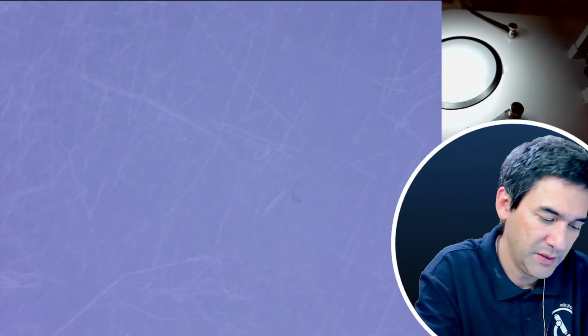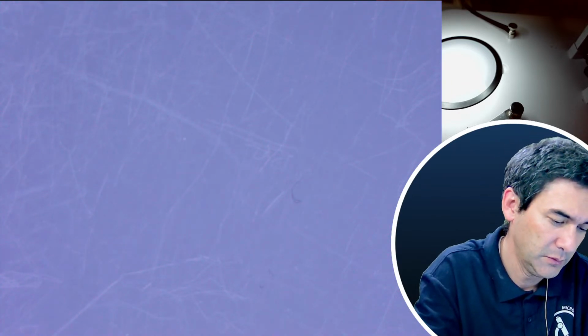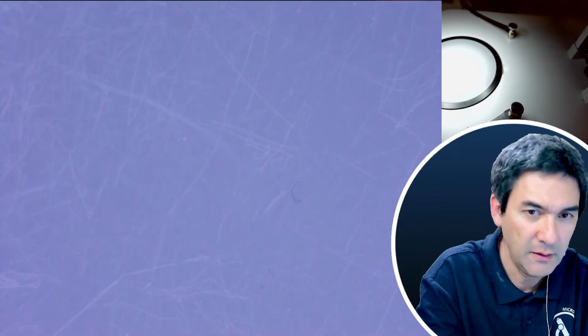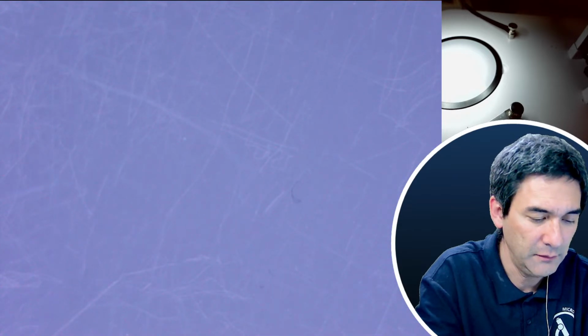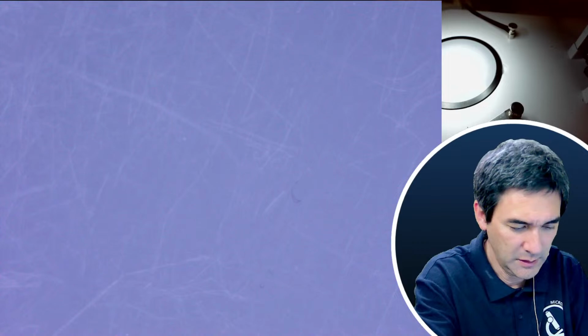So let's have a look at what this is here. I think I already looked at that, or not. I don't remember. Let me see. No, this is the one that I already looked at, from Cannes, from southern France. And this here is from Crete.